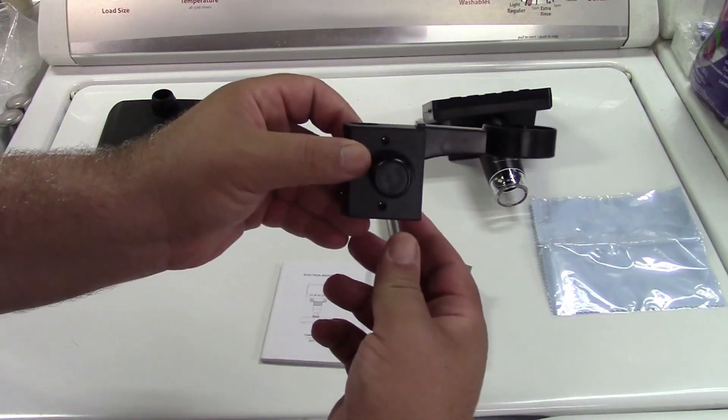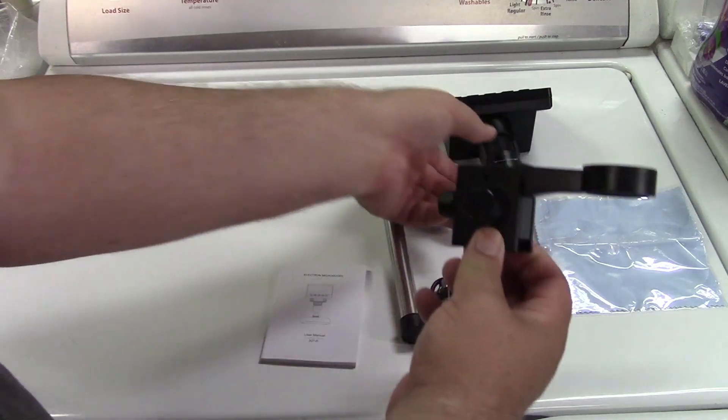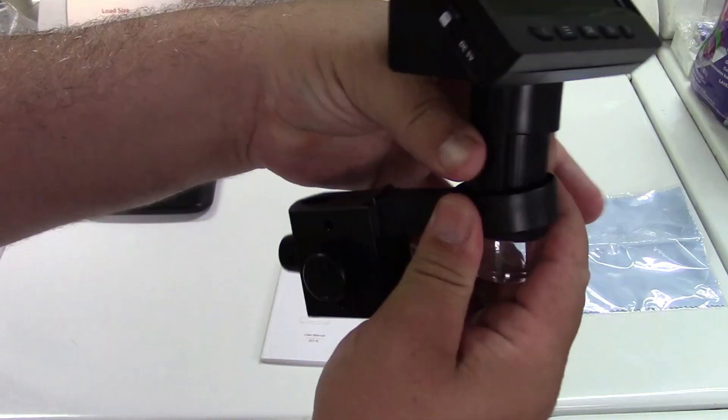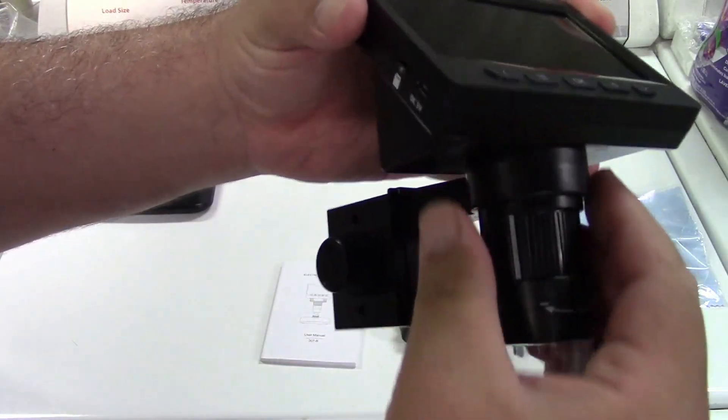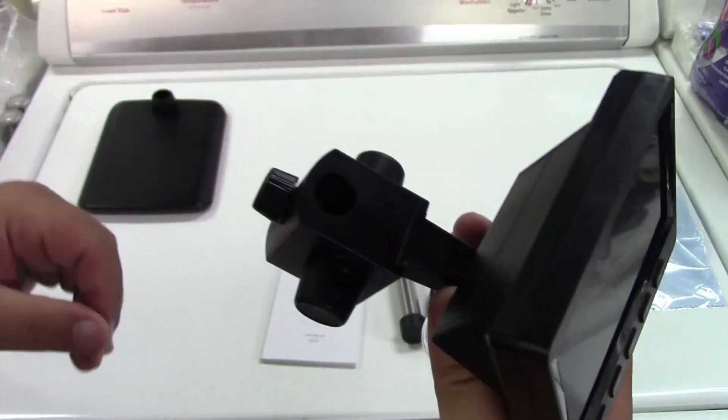This is the way it goes for the scope. The scope. It just goes right in there. Okay? Real nice and easy.